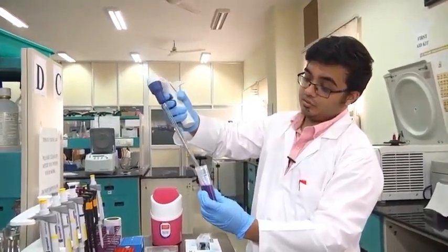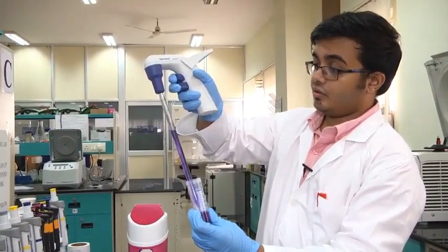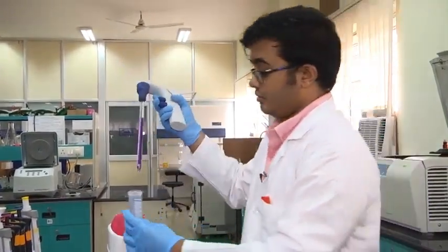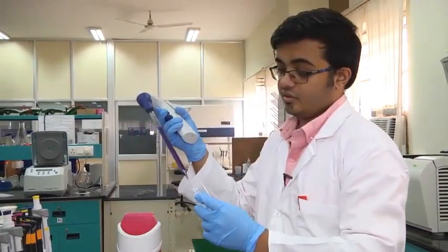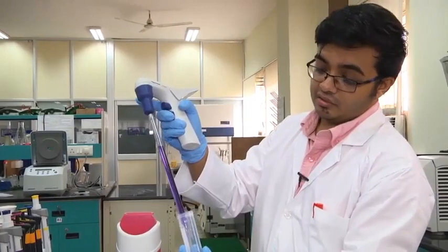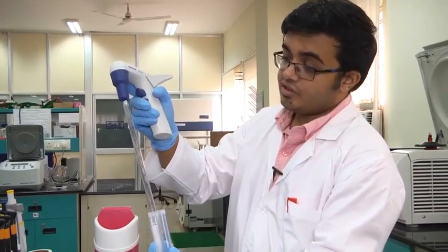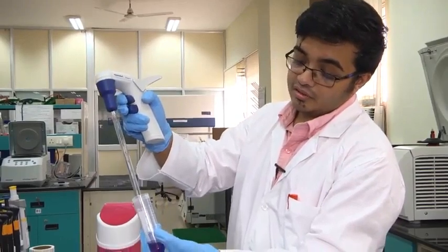I'll dip it into this solution, and when I'm pressing the upper button, see, I'm actually collecting liquid from here. Say I want around 10 ml, I just take it here, and when I want to dispense it, I put it into this tube, and now I will press the lower button. Once I press it, it gets dispensed. So yeah, if you press it hard, it gets ejected rapidly. If you press it slowly, it gets... Let me show it again.